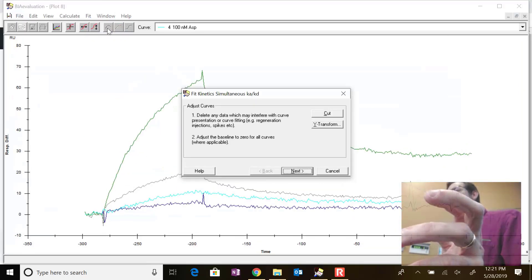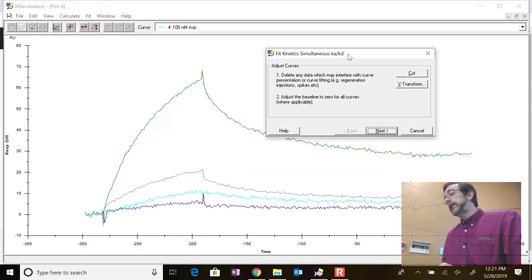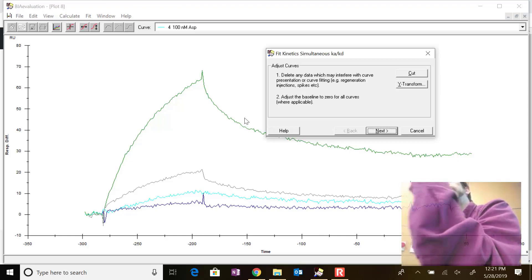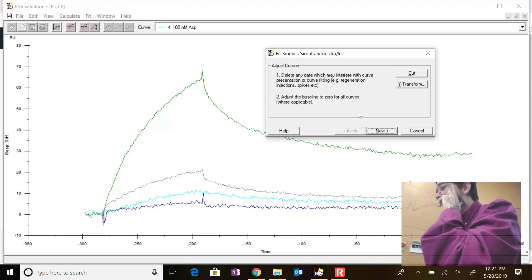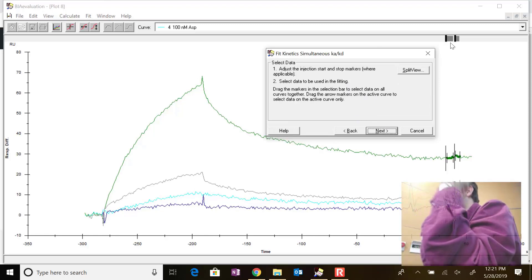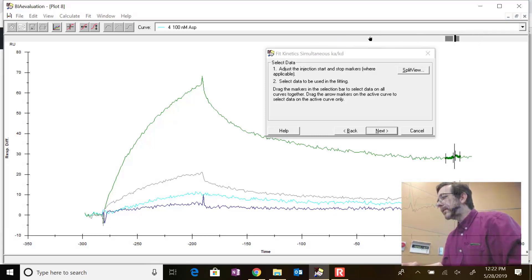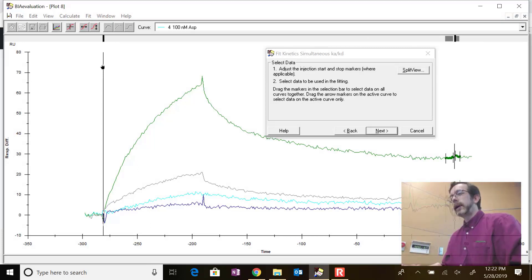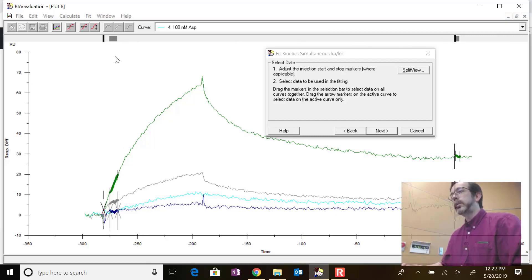Let's see how this looks when we fit the kinetics. Click the fit kinetics button - the shark fin button - fit kinetics simultaneous ka and kd. You're fitting all the concentrations at once, trying to find parameters for ka and kd that will fit the entire shape of all these curves. You're looking at eight regions - two regions per concentration. It says to get your data ready, which you've already done, so click next. Here you select the beginning and end of each reaction. It tries to guess for you but does a really terrible job.